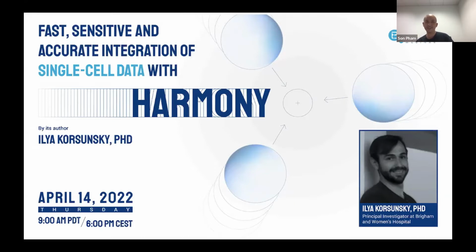As everyone knows, single cell data are being generated at exponential speed and create a lot of opportunity for exploring biology. But at the same time, it creates a huge challenge for the computational community. One of these challenges is batch effect removal. That is, removing the differences generated not from biology, but from different technologies. At BioTuring, we process a lot of data, and we test a lot of tools and algorithms out there for batch effect removal.